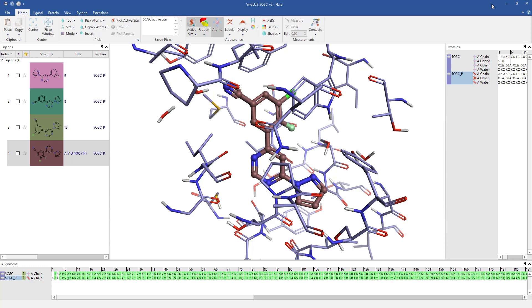I've loaded PDB entry 5CGC and three ligands with different activity at this target.